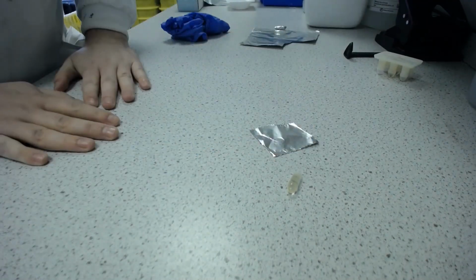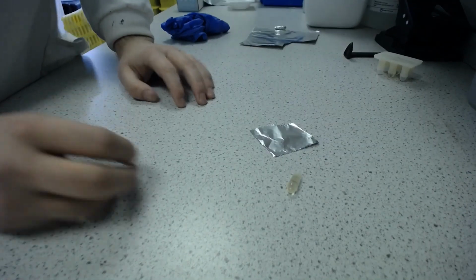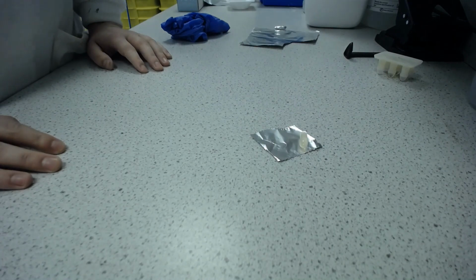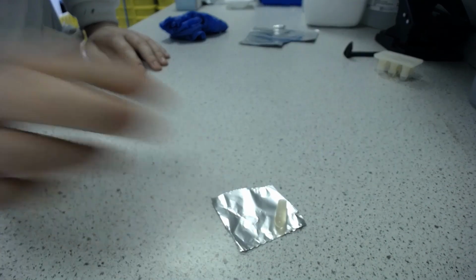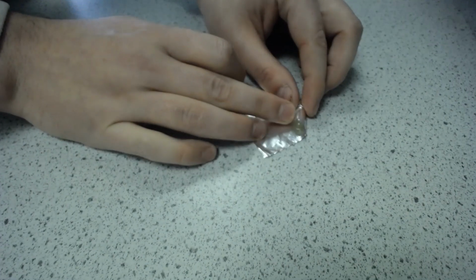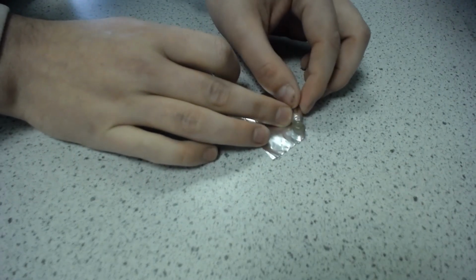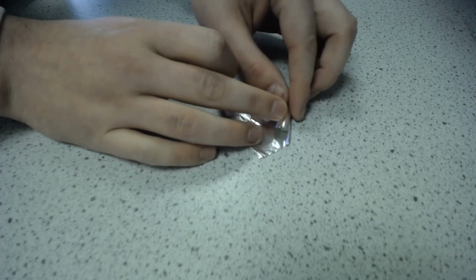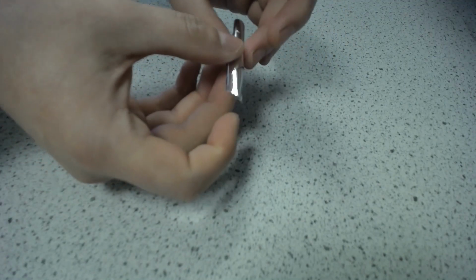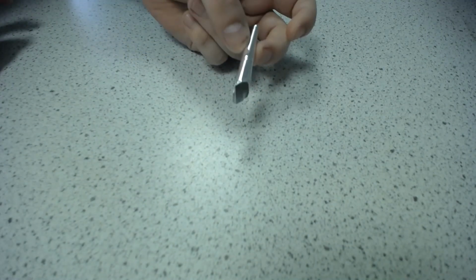The way I like to do that is to take my square of foil and put the suppository just in one corner, like that, and then I roll the first bit over, and then just continue rolling it till we get a silver cylinder, or sort of cigarette looking thing.